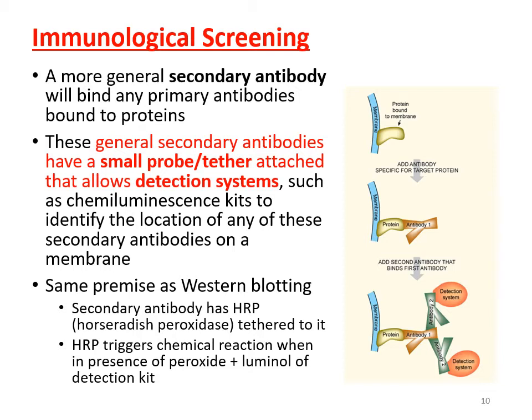So kind of think of this like screening for a particular protein, where it's almost like hybridization, but now instead of DNA, you're looking for a protein product. You take the gene library, you crack open all of those bacteria onto a membrane where their proteins will stick, and then you look for the exact protein that you want.